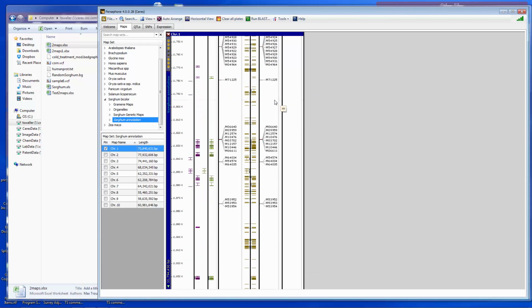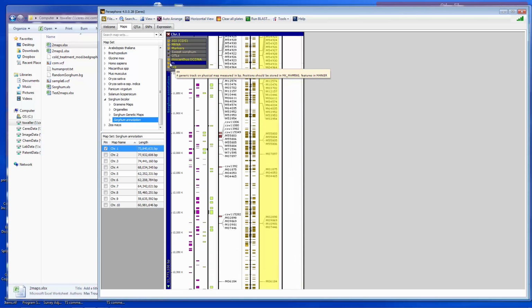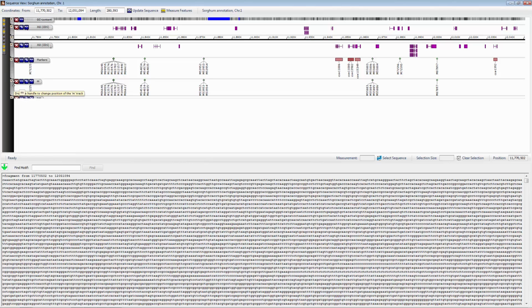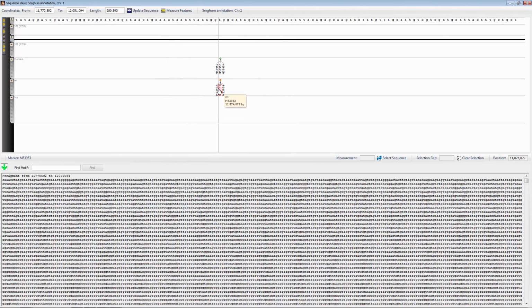And all the same functionality exists. So the zoom functionality exists. And also when you select a given region to move into the horizontal view, your data also stays consistent with that. So here's your M track and your TXP track located right there. And once again, you can zoom all the way down and see the markers that you just loaded.